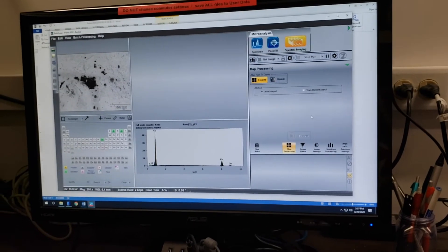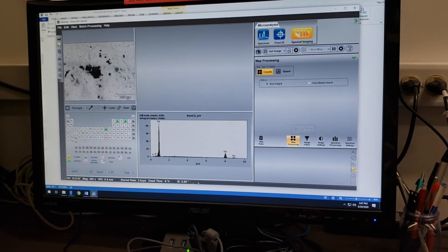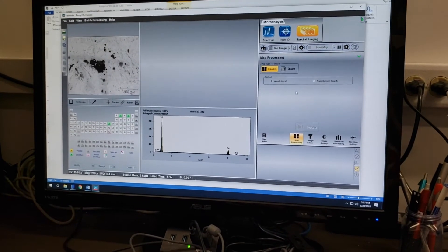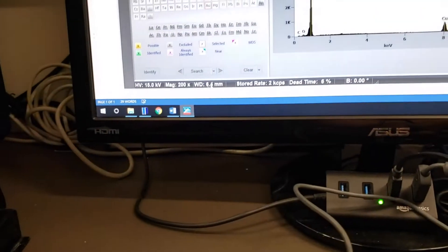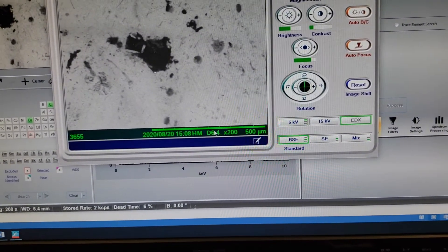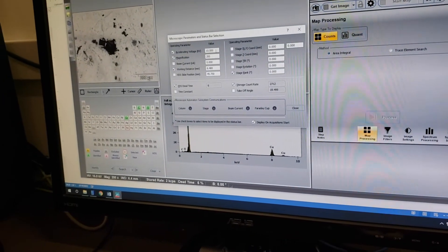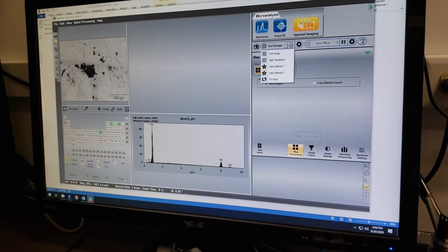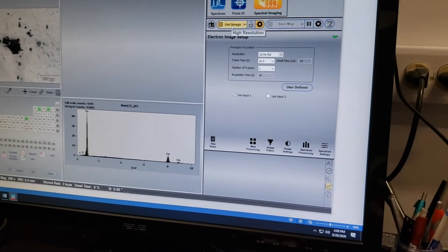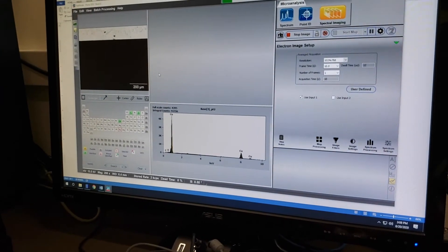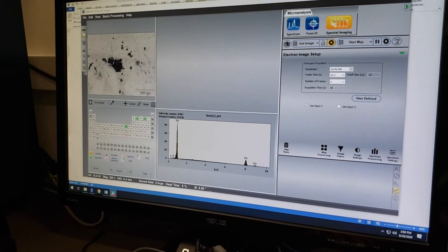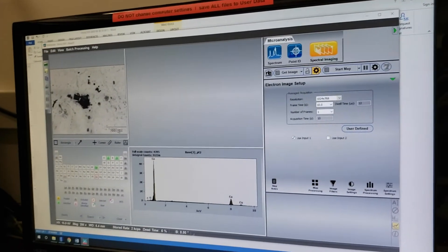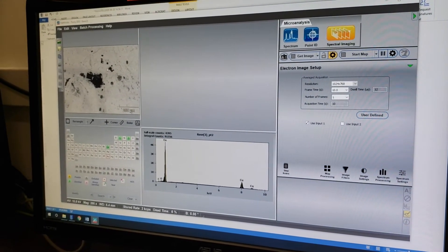In spectral imaging, we are not able to rename our spectra — there is a bug that doesn't allow it. So you just have to know what 'Base 4' means; you can keep a log in your Word document. First, verify that magnification and working distance match your imaging software. Then click the dropdown of Get Image, click High Resolution, and click Get Image to get a fresh image. You must get a new image usually within the last minute in order to do mapping.